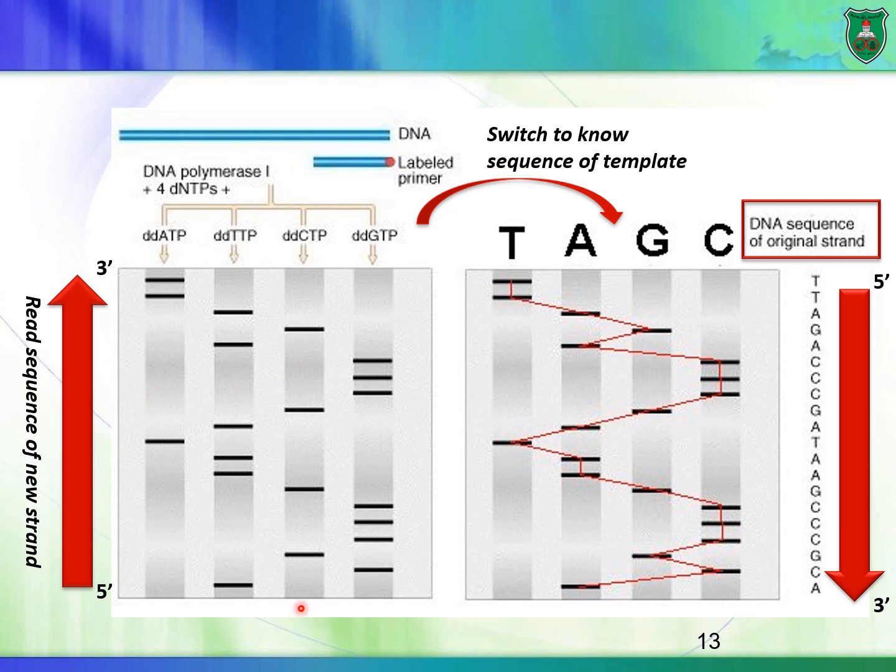So right here we have this gel. So the sequence of the newly synthesized DNA is what? It is right here, it's T, then G, then C, then G, G, G, and I'm moving from the 5' end to the 3' end. If I ask you what is the sequence of the DNA template, you're gonna flip it, right?